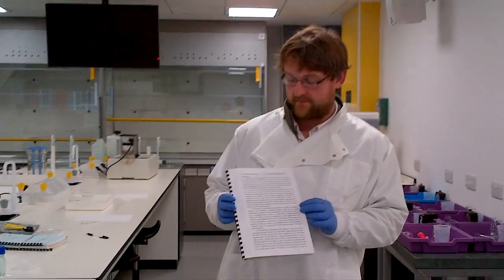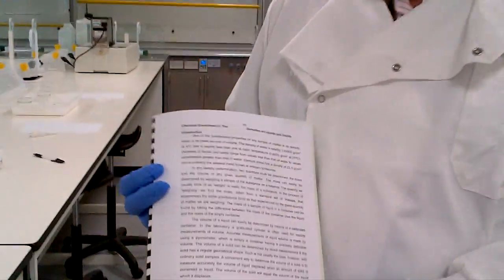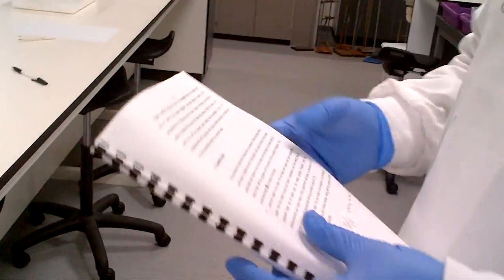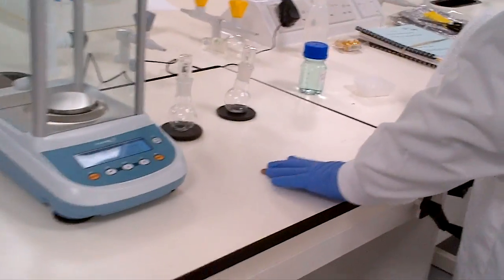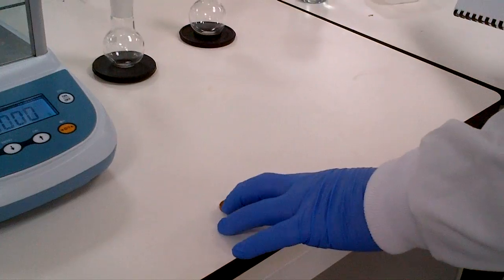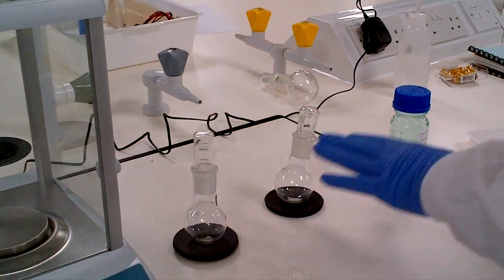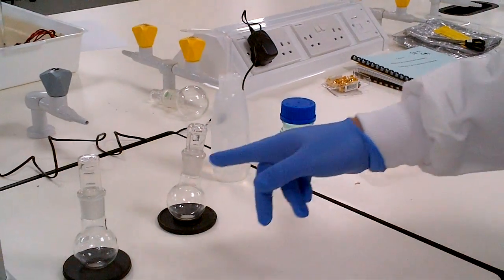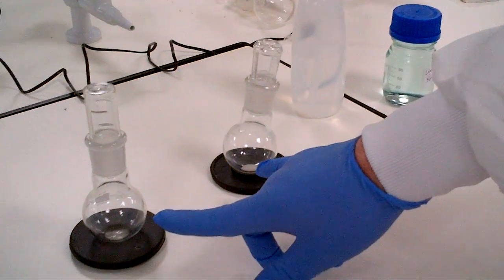So this practical video is for scientific methods, experiment number 6, chemical experiment 6, the densities of liquids and solids. There are 3 parts to this where you've got to use an analytical balance to be happy with weighing the masses of coins correctly, and then you've got to measure the mass of water to find the volume of a flask.